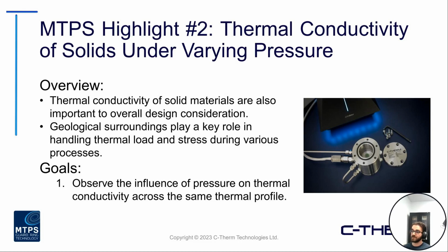The next example here with the MTPS is looking at the thermal conductivity measurement of a solid that was taken under varying pressure conditions. So again, we're just looking at one sample here, a sample that was tested at room temperature, but under different pressure conditions. And this was all done with the MTPS high pressure cell.